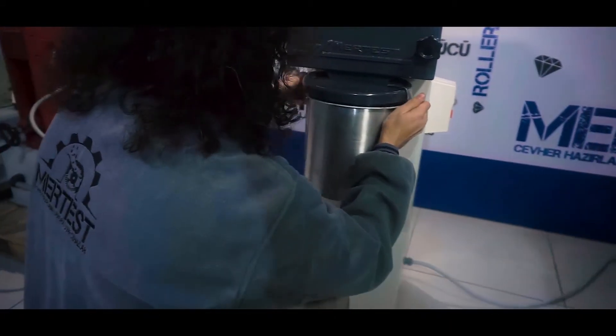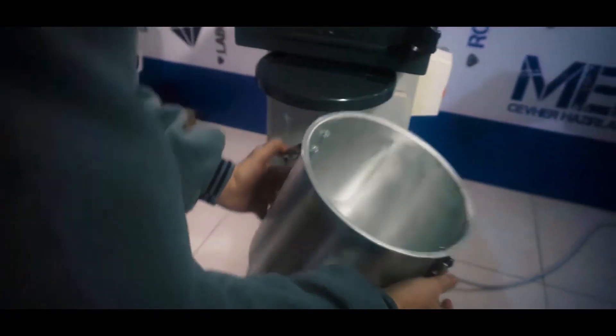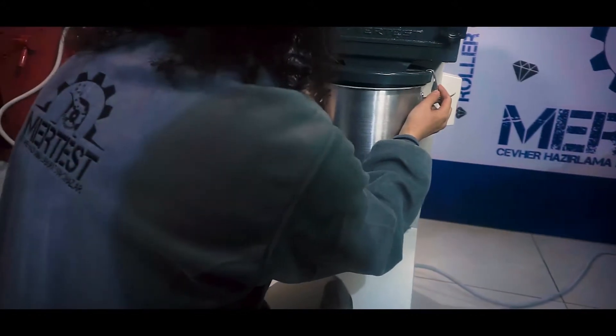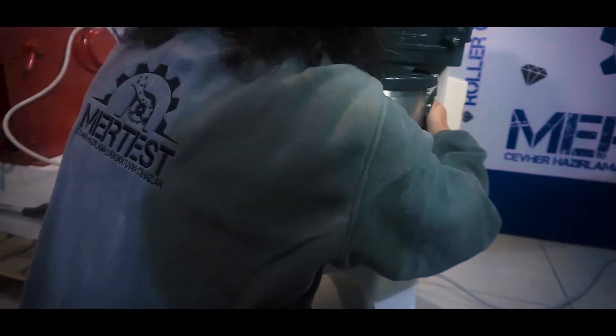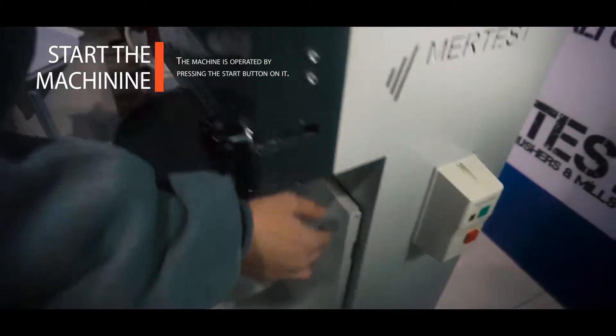The clips are pressed into the closed slot on the device and locked into position. After this operation, the machine is ready for operation. The machine is operated by pressing the start button.